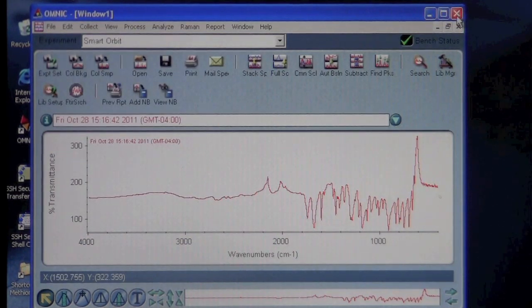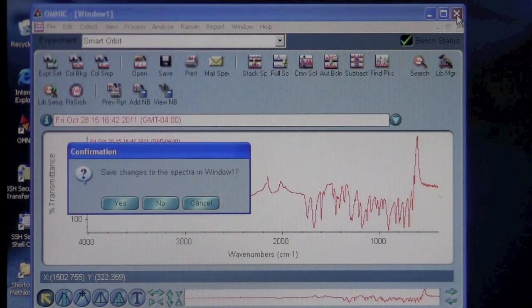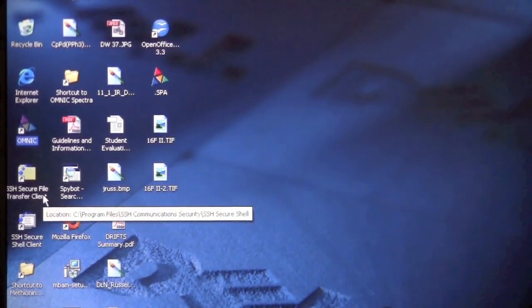When you're finished, you should close OMNIC and leave the instrument. You can leave the instrument on and it'll be ready for the next user.